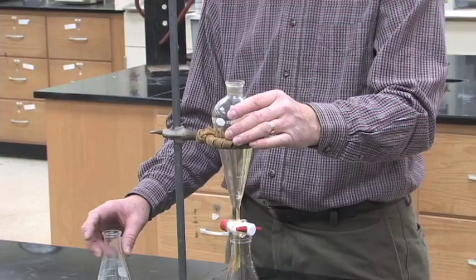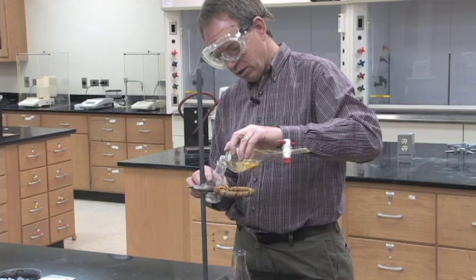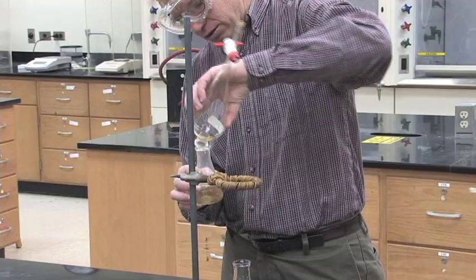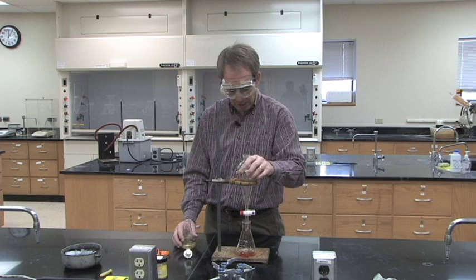Be very careful not to go too far, then pour the top layer out of the top of the separatory funnel so what's inside the stopcock doesn't end up going into the wrong flask. You'll always have a mixture of both layers inside your stopcock, then add back whichever layer the procedure tells you to as you do your extraction.